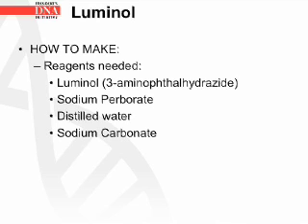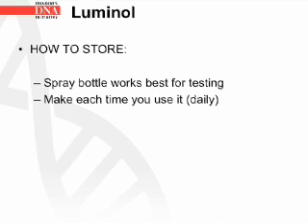Reagents needed to make luminol are luminol, which is 3-aminophthalhydrazide, sodium perborate, distilled water, and sodium carbonate. A spray bottle works best for testing with luminol because luminol is usually used to test large areas. Luminol must be made each time that it is used.